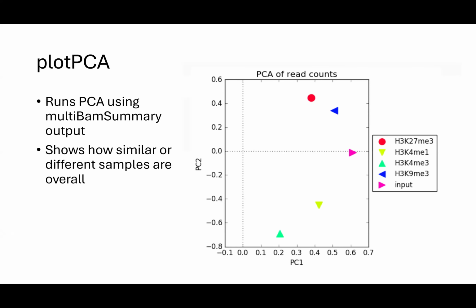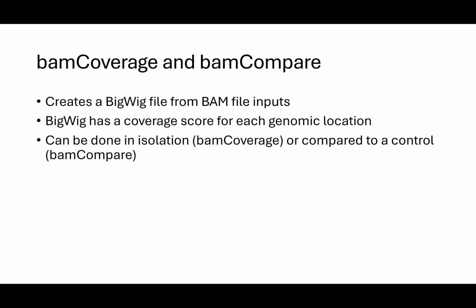Dumb question: what is the input map? So that is the IgG control. Oh, the control. Probably in this case for ChIP-seq, they might have done their control without doing immunoprecipitation at all. Some people also do that, just the DNA before immunoprecipitation. You can also do it that way. It gives you basically the same information. But generally just one of those controls.